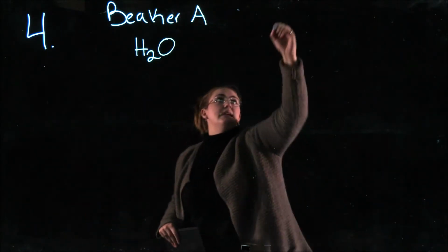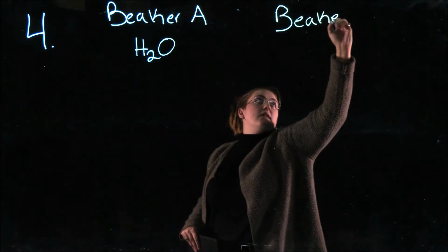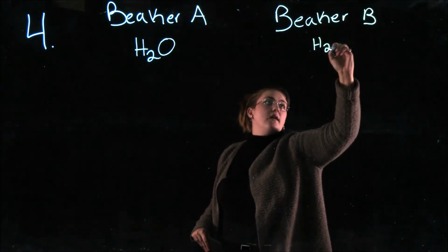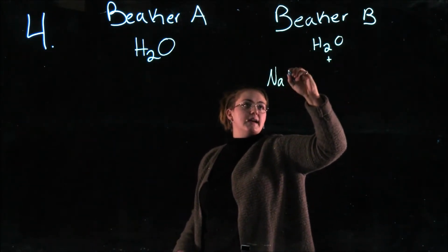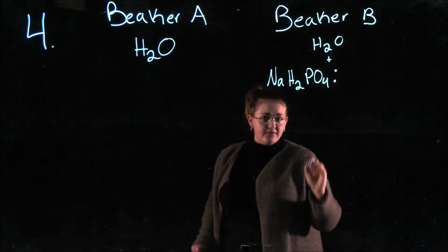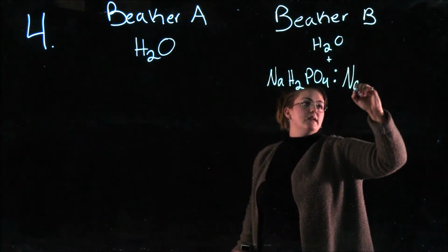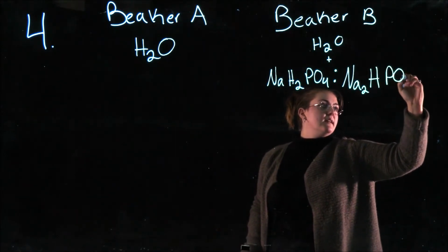And in beaker B, we have water plus our sodium dihydrogen phosphate in a 50-50 mix with our sodium hydrogen phosphate.